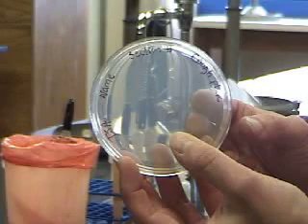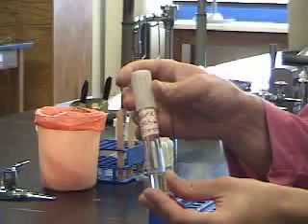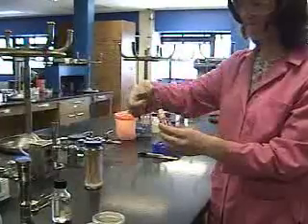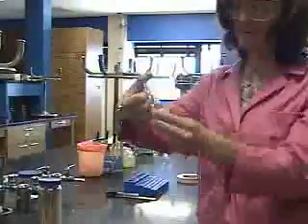Now for the real fun — get your cough plate and cough three times on your cough plate. Get big, large, guttural coughs. Finally, we're going to inoculate our TSB broth by putting our finger over the top and inverting the tube two to three times.